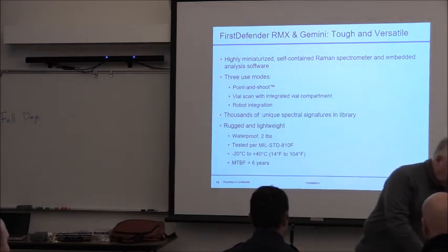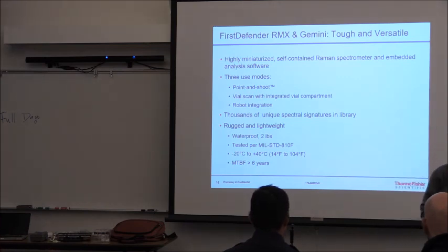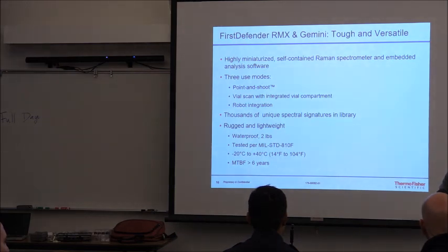We can do the same thing with the Gemini. The Gemini has its probe on the side, and it has the cone built on, stuck onto it all the time. Take the cone off, and it's just that little cone. You have a spare cone in your case.